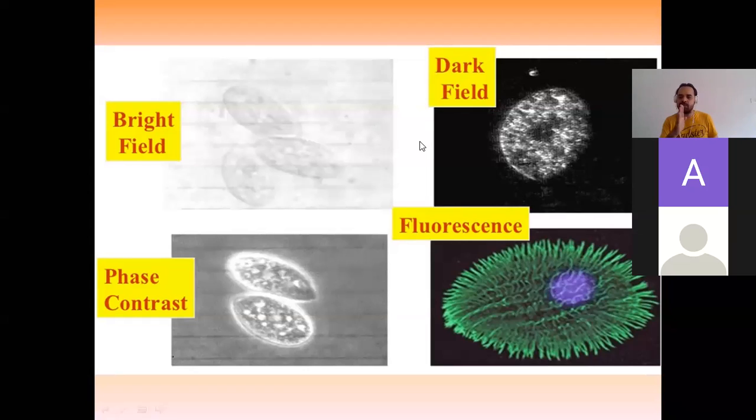So the change when the light is being absorbed and when it is being given back takes a small time. Within that short period, when the light is being given back, the change in the wavelength of that light will result in its fluorescence nature.